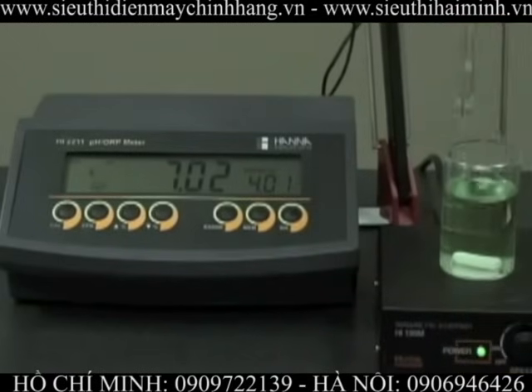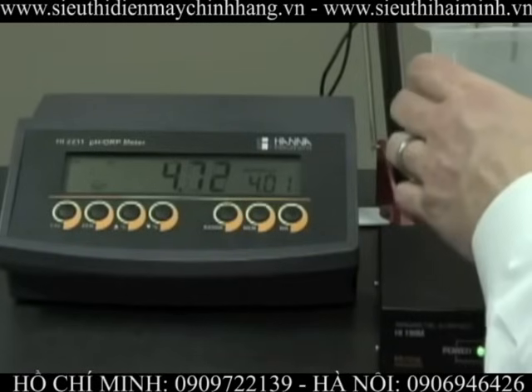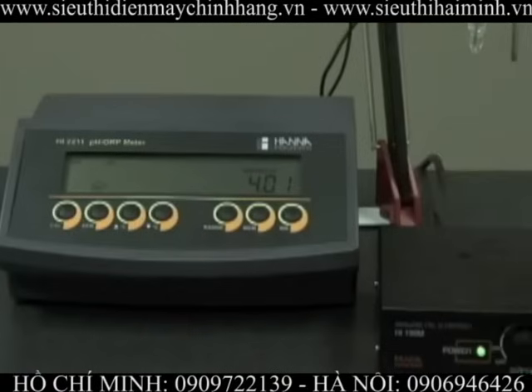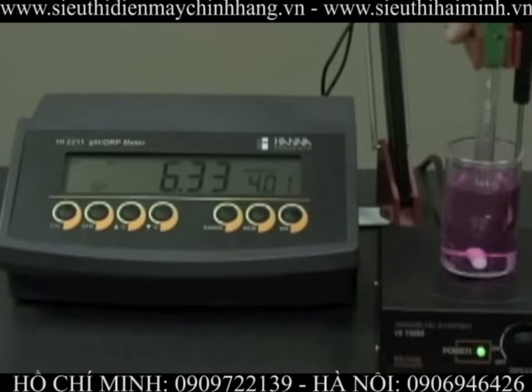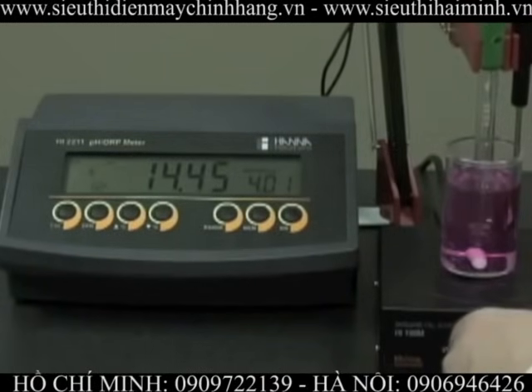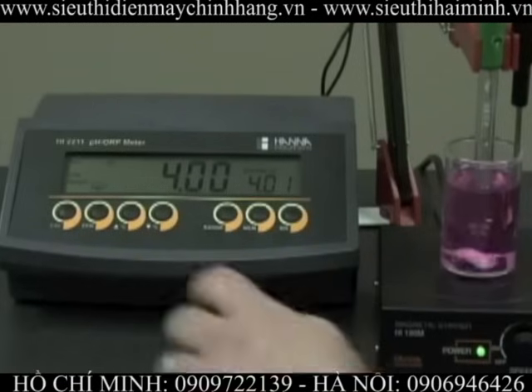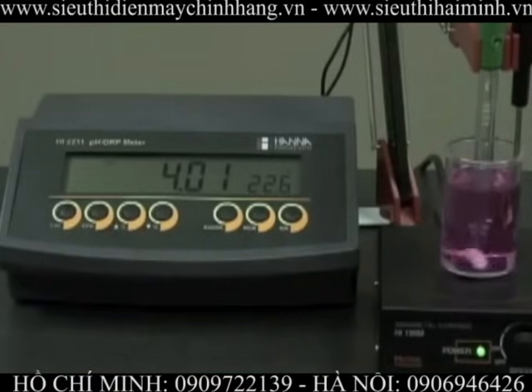Turn off the stirrer. We rinse our probes again with deionized water, place the probes in pH 4 buffer, and start the stirrer. CFM is displayed, we press the button, and now we're ready to measure.